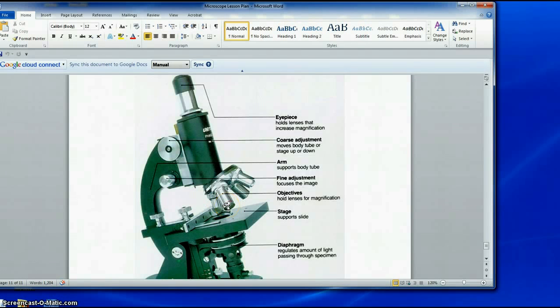When you are at higher magnifications, your field of view gets much smaller, and the depth of focus is much, much shorter. So this means if your microscope slide is made to be too thick, you may not be able to focus on some items because they're too deep into the medium that the specimen is on under the cover slip. So that can be a problem. Experience is the best teacher, and practice is needed to understand what's happening and to be able to do a good job with it.